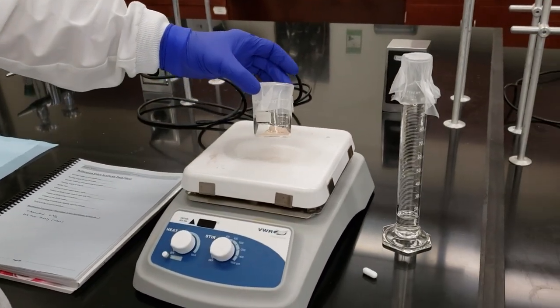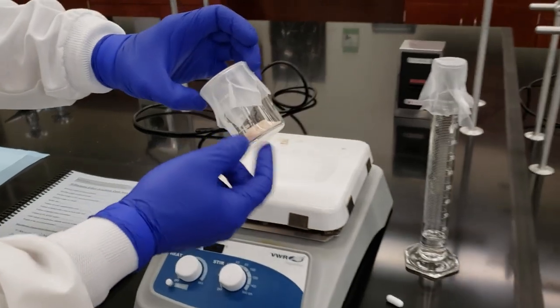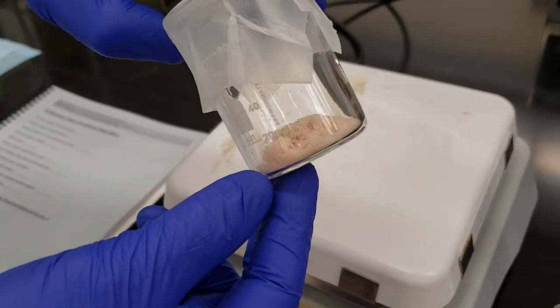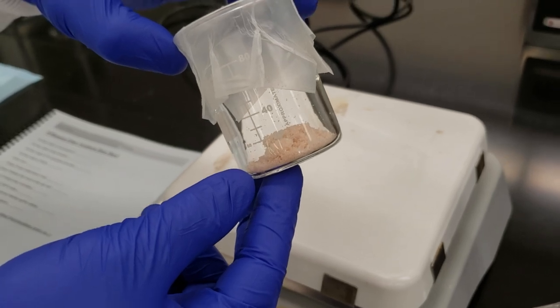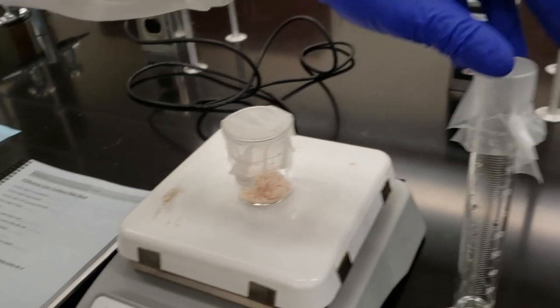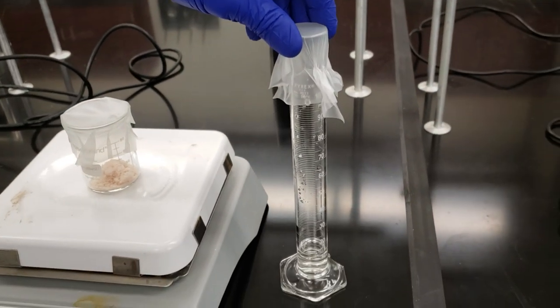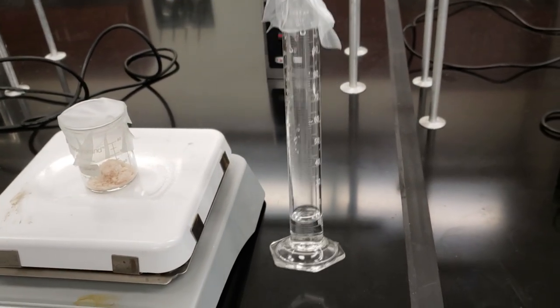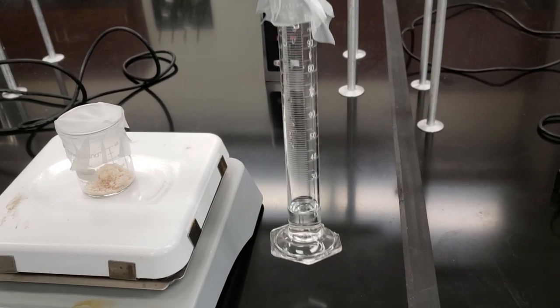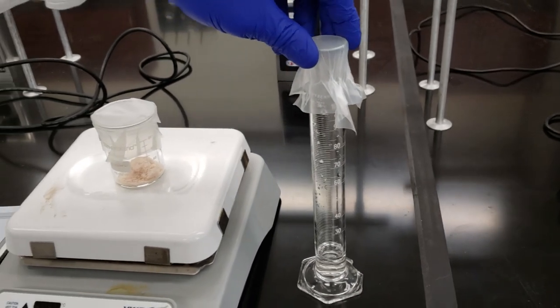We have our 4-bromophenol, which is a light pink powder that we can see in the base of our beaker here. We've got 6.922 grams of this powder. We've also got 14.247 grams of our 25% KOH solution. This is approximately 12 milliliters. We're going to add these two together.